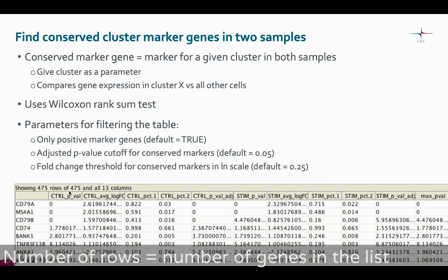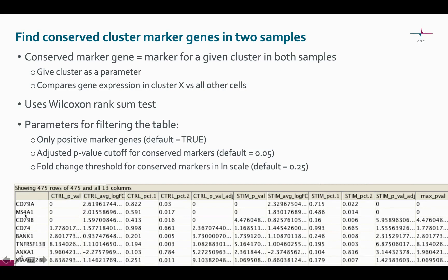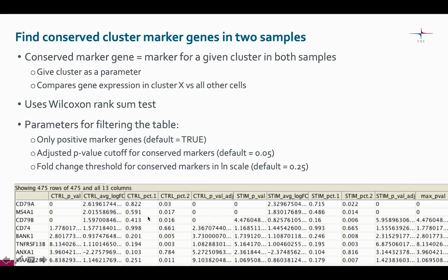Up here we can see how many genes are in the list. Here we can see the gene names, and here are the p-values and the fold changes. Please note that the fold change is in the natural logarithmic scale, ln. These values here are percentages of cells expressing the marker — this one means the percentage in the cluster in question.